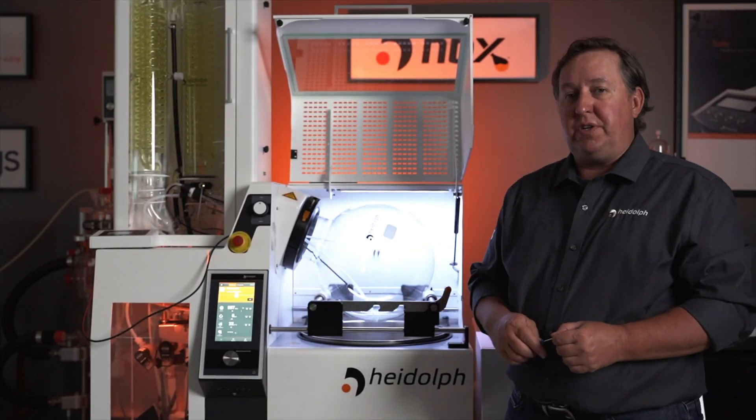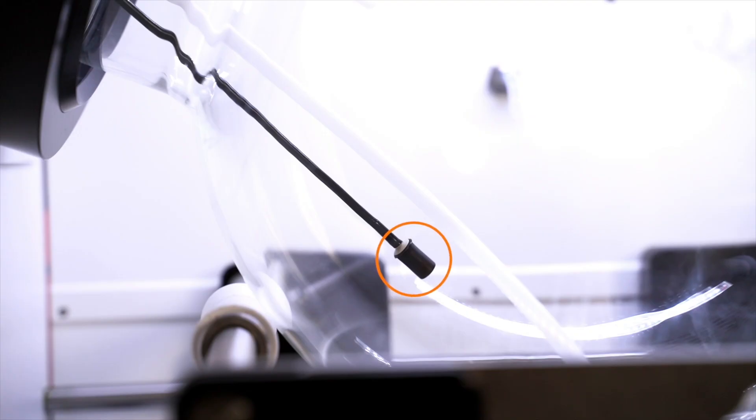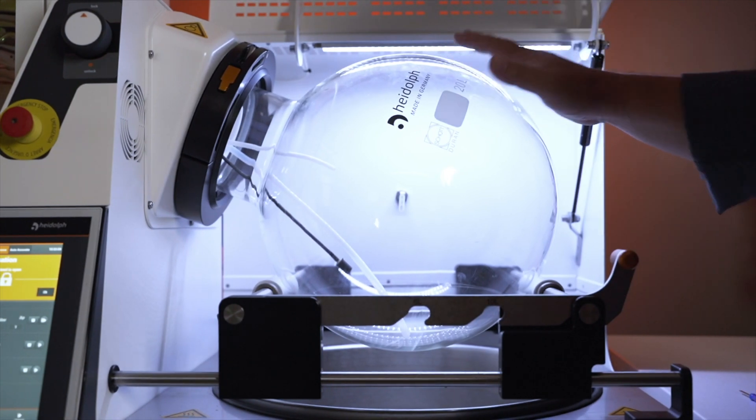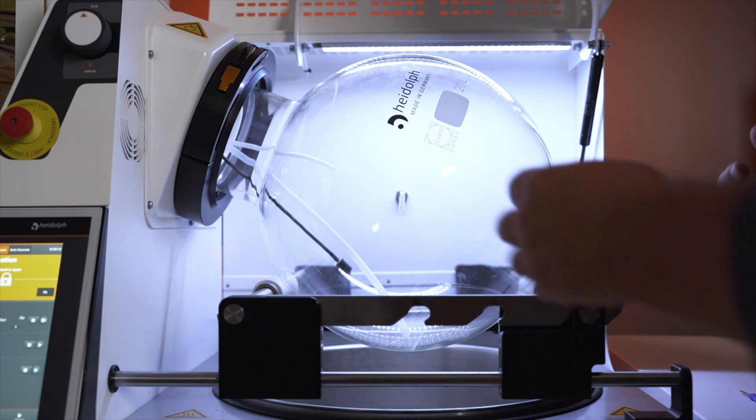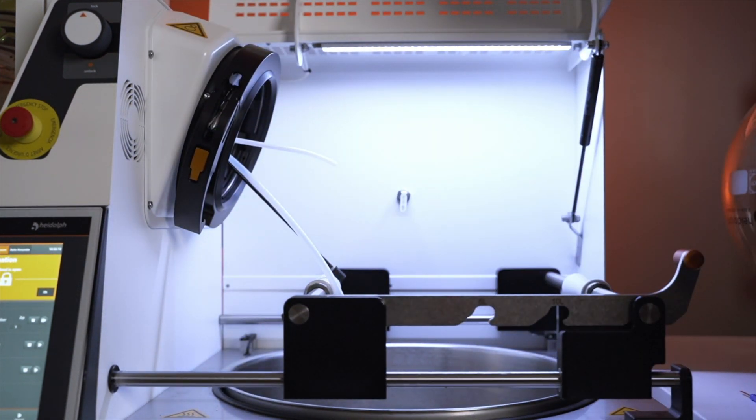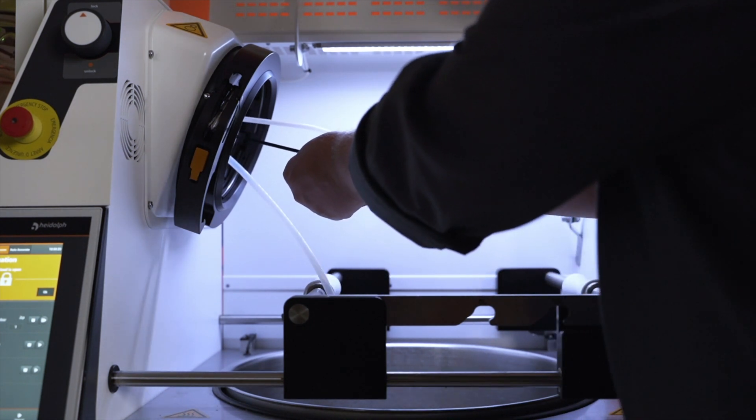Okay so next I'm going to show you how to adjust the sensitivity of your product level sensor inside the evaporation flask. Every time you do remove the flask I do recommend calibrating the sensitivity of your product fill sensor that's inside the evaporation flask. In order to do that with your flask off you do want to make sure that you clean the sensor of any potential debris.